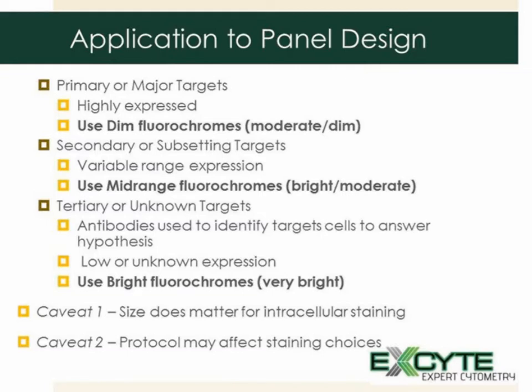Finally, I'm going to then pair the markers that I'm most interested in, the ones that I'm actually doing the experiment about, with the brightest fluorochromes I possibly can. I want to get the best resolution and the best sensitivity, so brighter is better. This is where I would definitely want to use things like PE, APC, some of the newer Brilliant Violets, some of the quantum dots for that assay. There are two caveats to panel design that you should take into account.